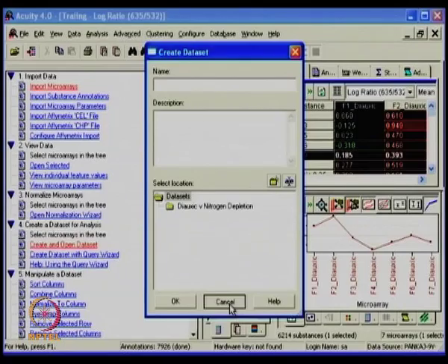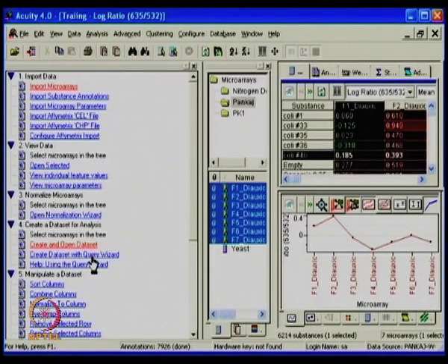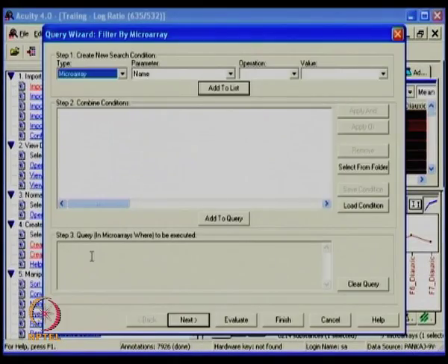Another very important option is creating a data set from a query. The meaning is that you can define different criteria, from the design of the experiment to a little bit more details of statistics, to decide what I want to import. Say, for example, I can define which experiment type I want, or based on the parameters, I can say that I want to import the data in the form of only one particular parameter.